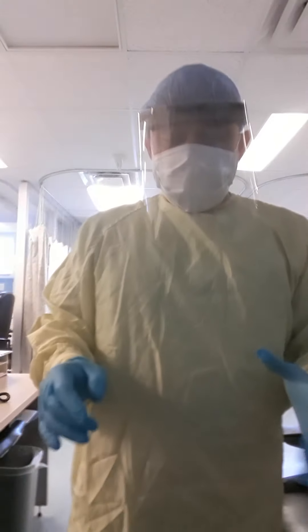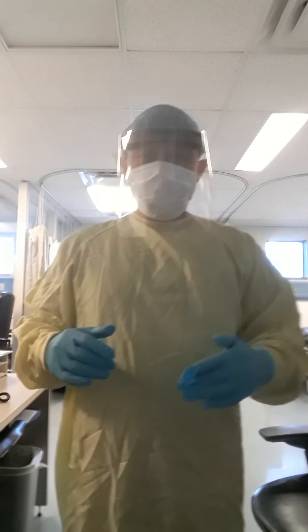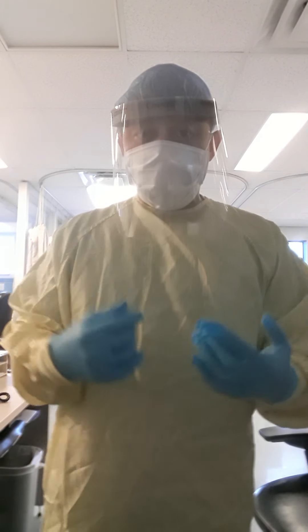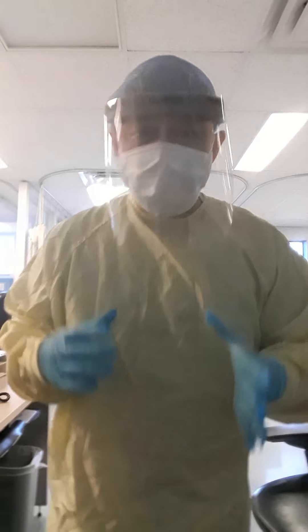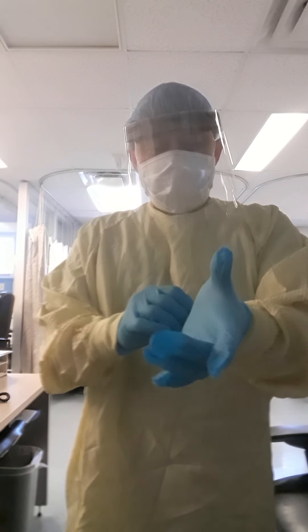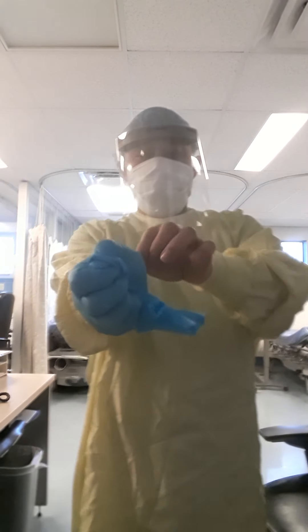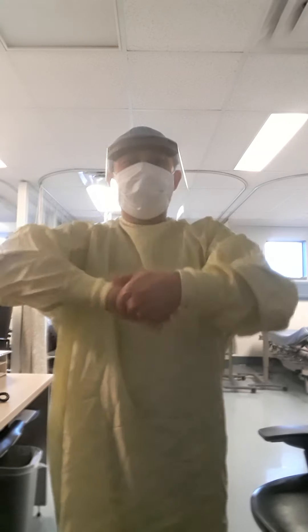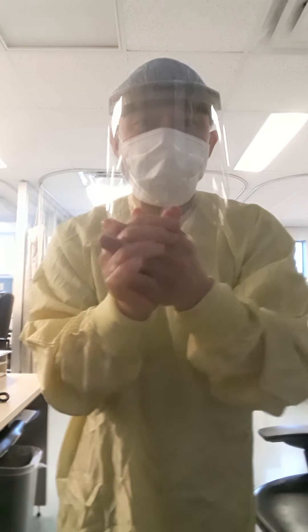Now we're done — we're going to start removing the PPE, so the first thing you remove is the gloves. Make sure you dispose of them properly because this is already contaminated, guys. Okay, let's start with the gloves. There we go — sanitize your hands, no rush, just wait a bit. Next is the gown, guys.